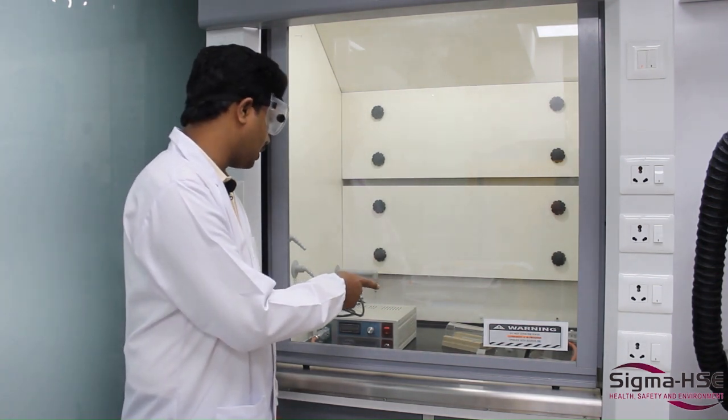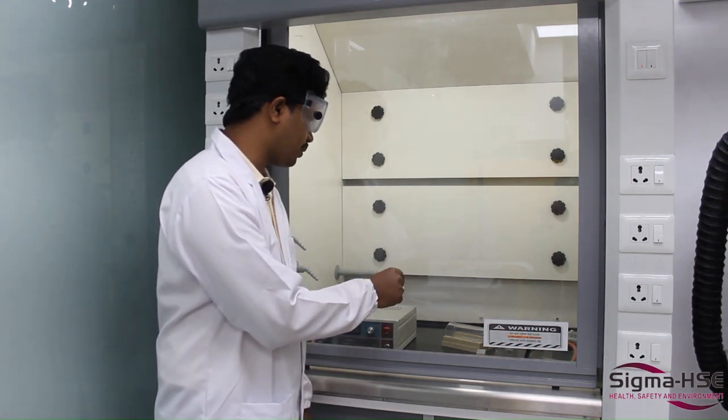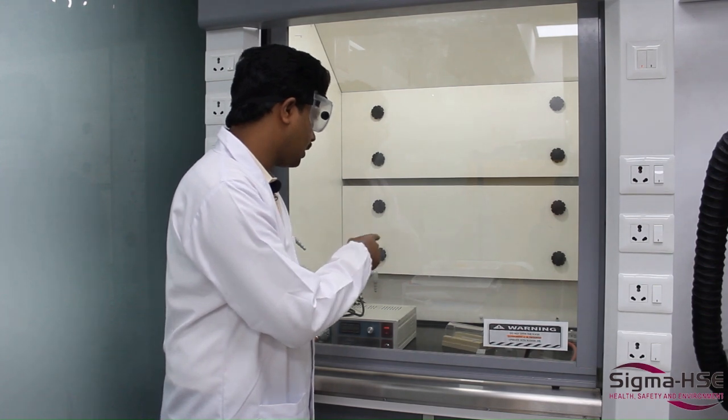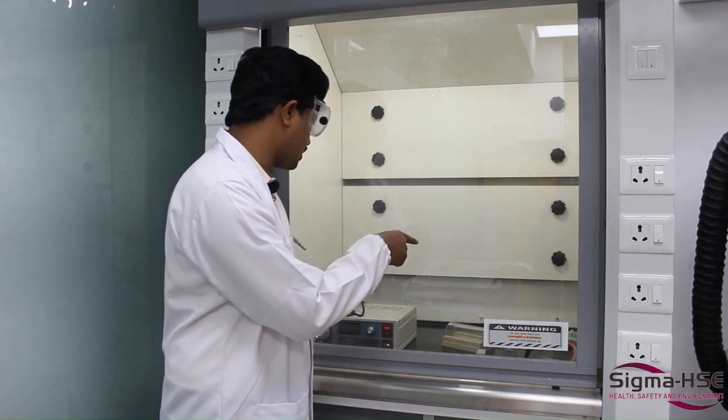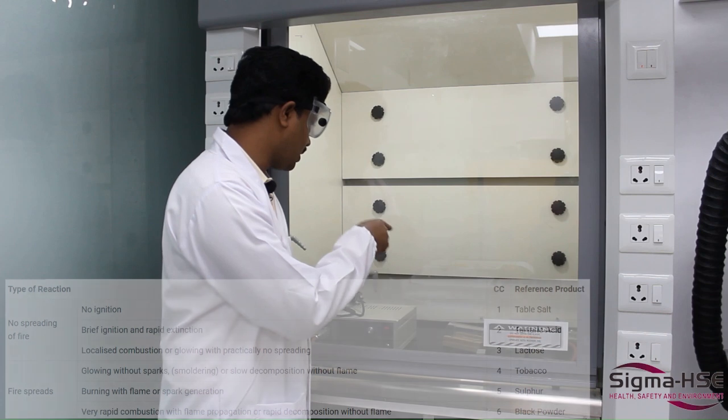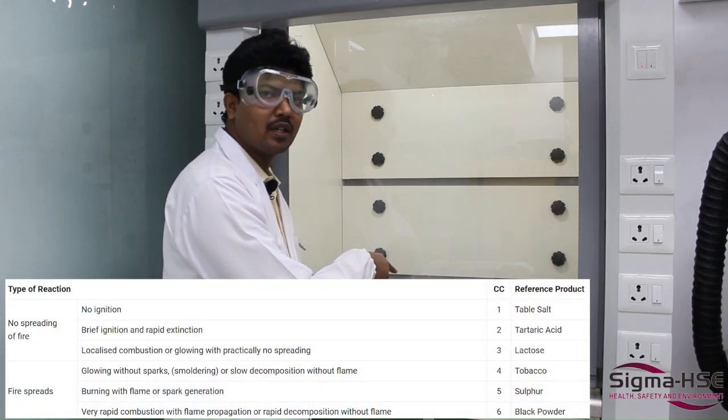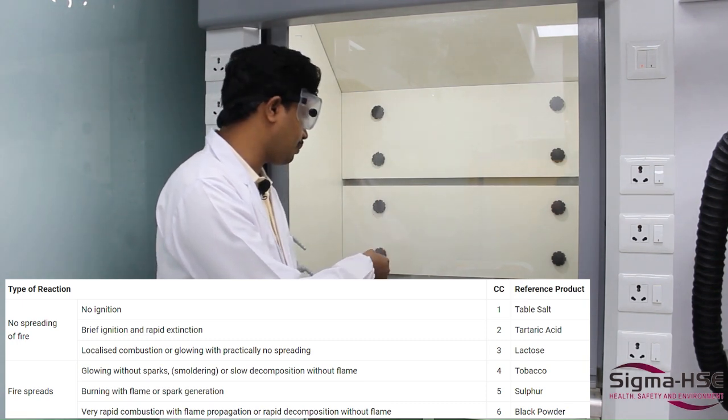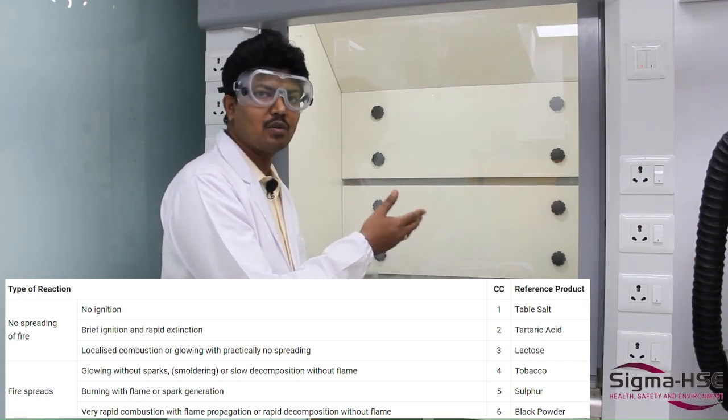Here we can see a small strip molded, and when it is placed inside the glass tube, the platinum wire which has around thousand degrees C, when it comes into contact with the material, it gets ignited.